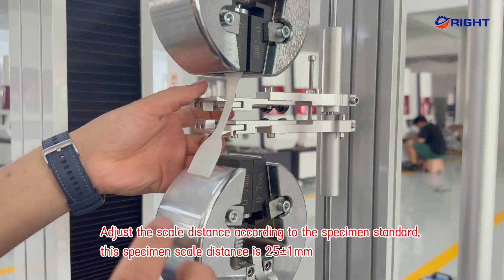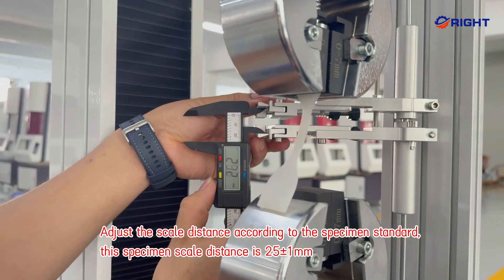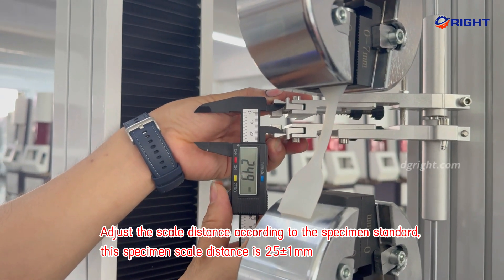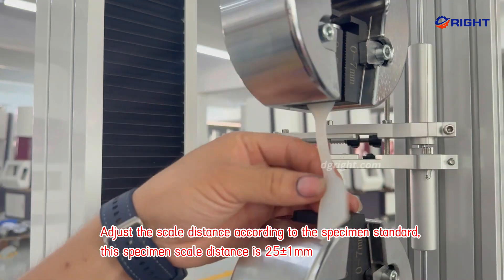Adjust the scale distance according to the specimen standard. This specimen's scale distance is 25 plus or minus 1 mm.